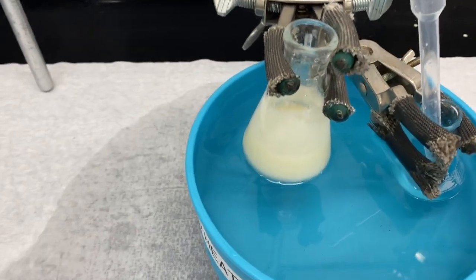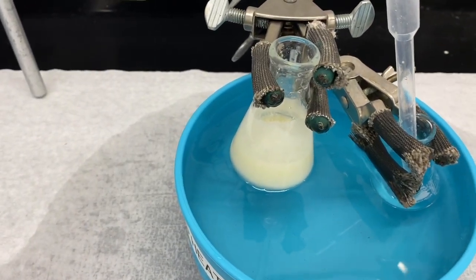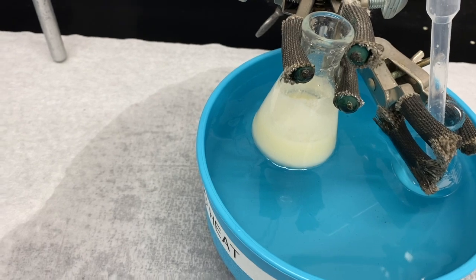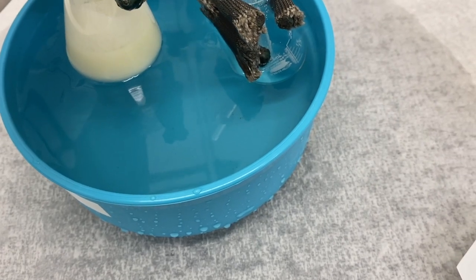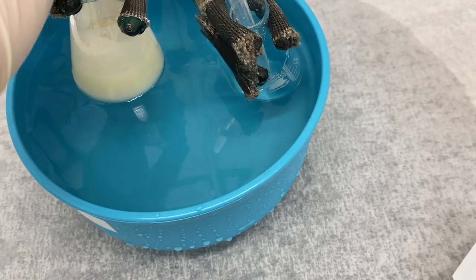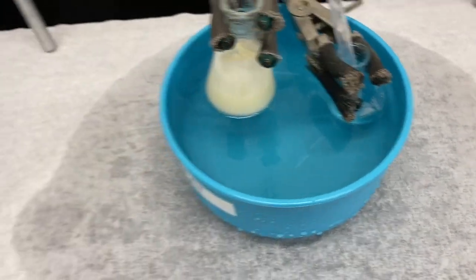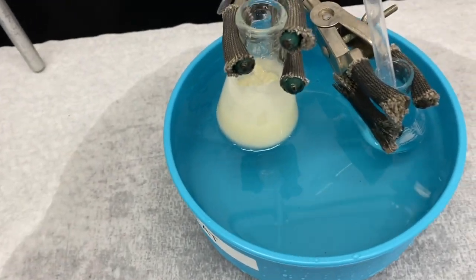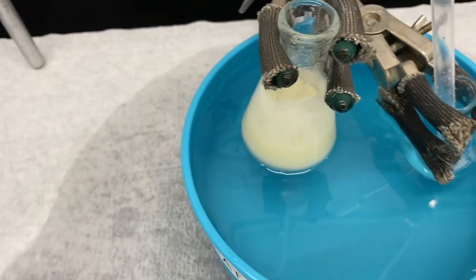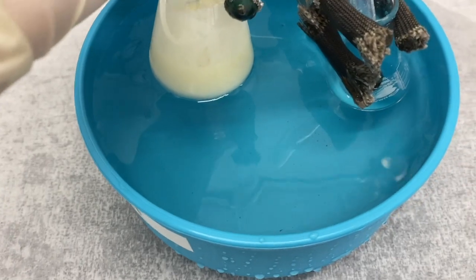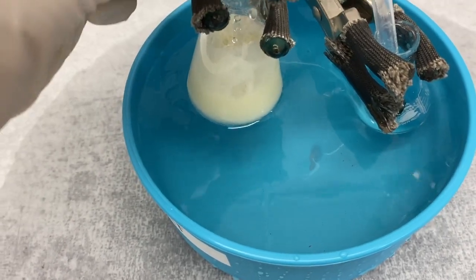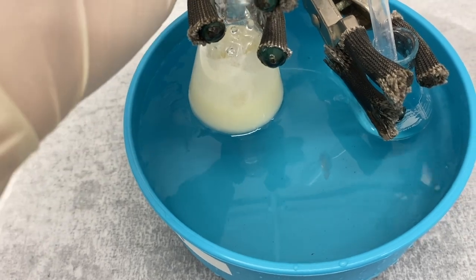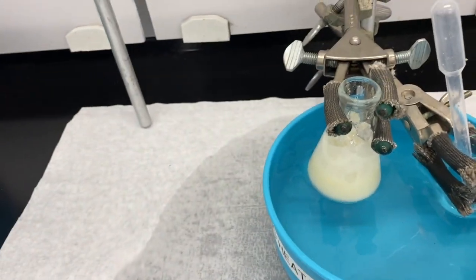So now we're going to quench this reaction by adding just a little bit of small bits of ice. You can see I've just got a little handful here. And we'll probably need this to warm up a little bit over time before we filter so that we don't end up with just lots of ice in our Buchner funnel.